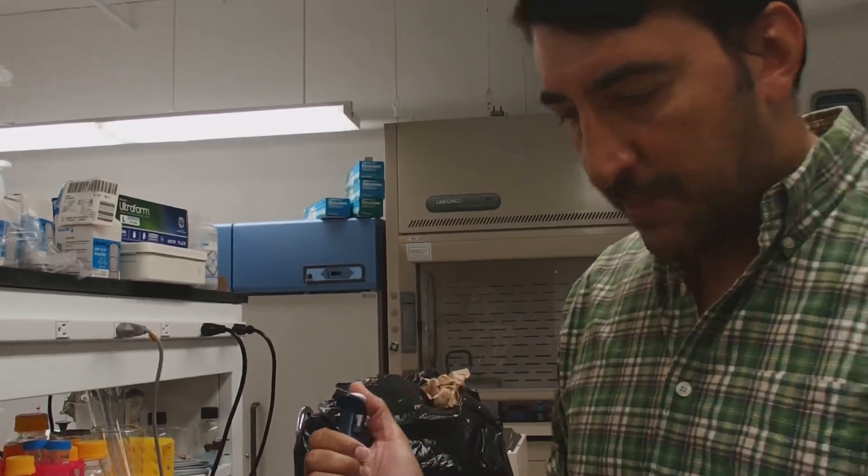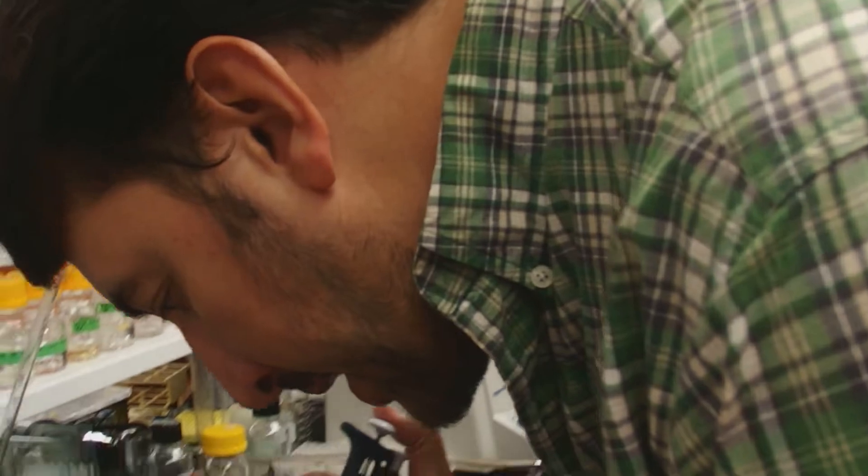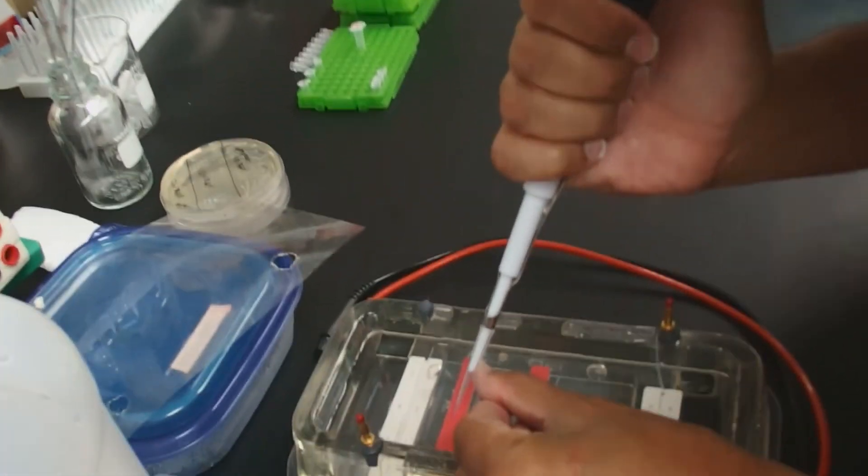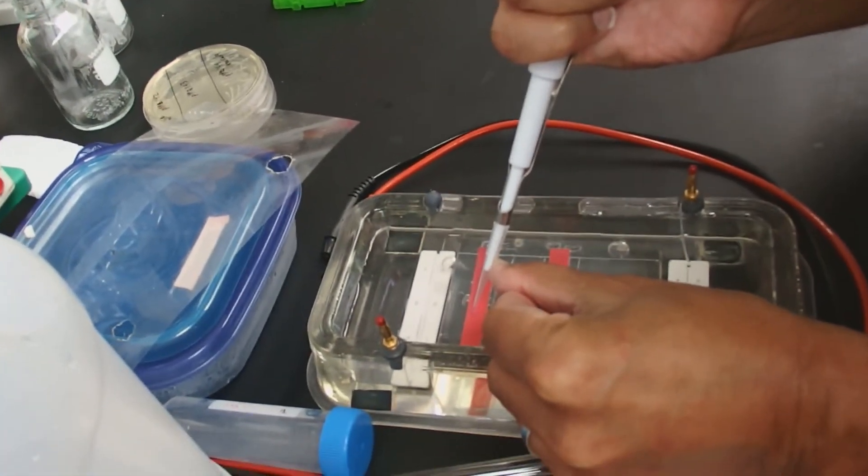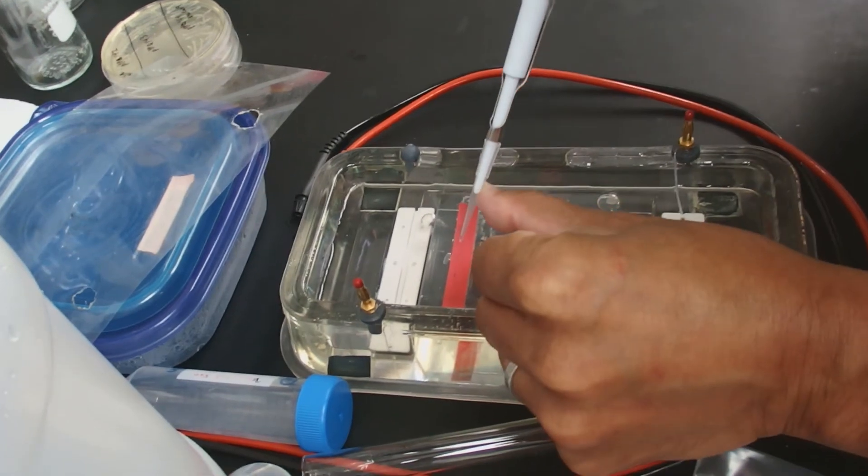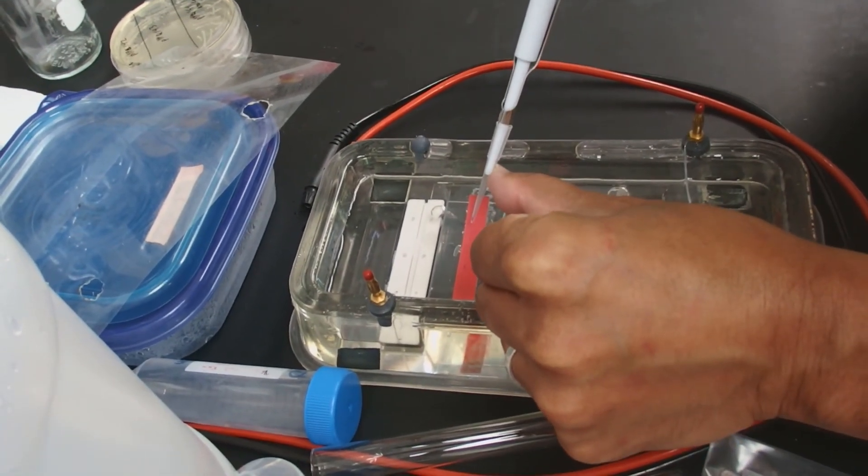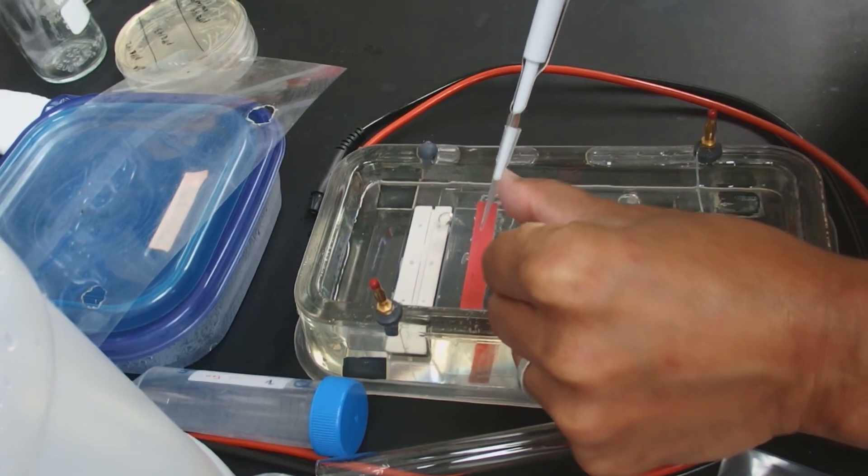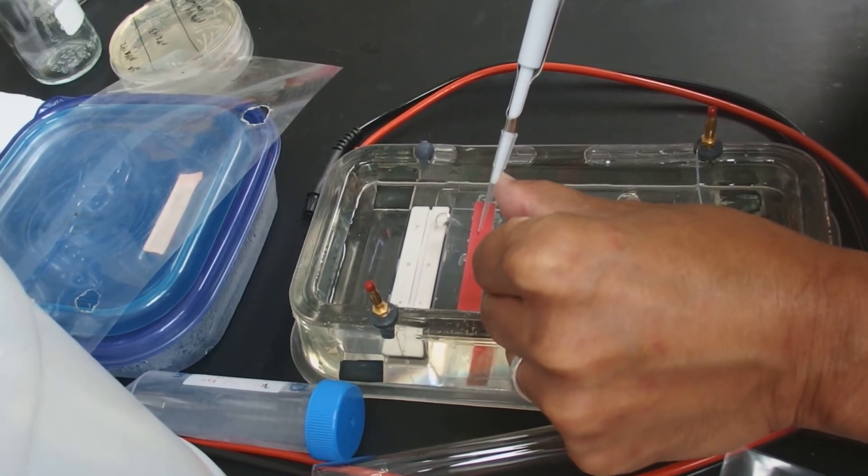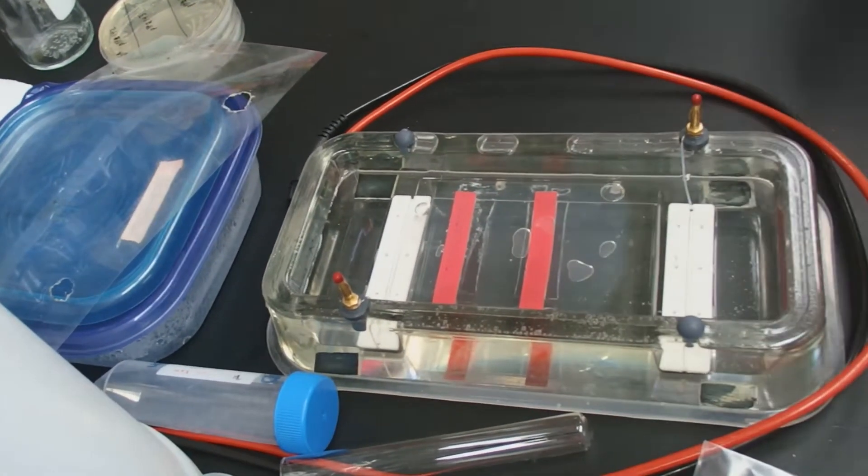Each one, that'll be about 1 microliter in each well. I'm going to get down here, and I have five samples, so I'm going to leave five spaces in between. One, two, three, and there are the ladders there.